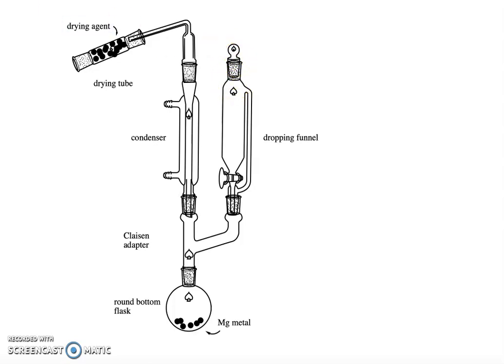The first thing we're going to do once we have all this glassware set up is flame dry it to make sure we remove all of the moisture. We want our glassware completely dry. Once this is flame dried and we're sure that there's no moisture left, we're going to add the bromobenzene.